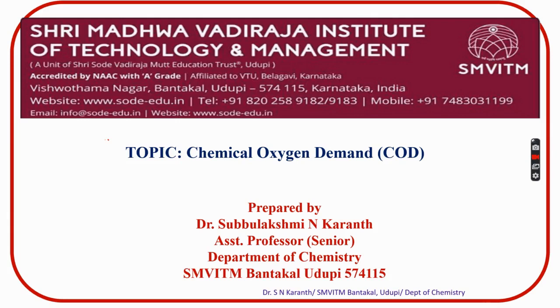Here I'll cover what is chemical oxygen demand, the characteristics of the COD parameter. Say the sewage or the waste content which is present in the water, normally considered sewage. Sewage is a liquid waste which includes human and household wastewater.